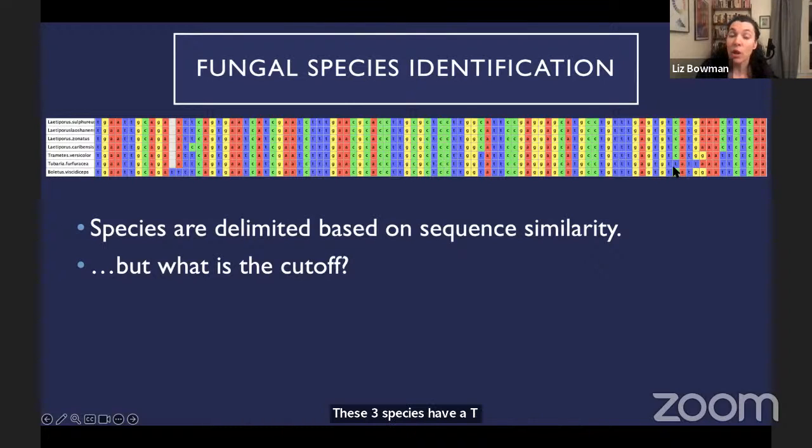So you can kind of go along and compare these sequences that you get back and look at how many differences there are. The more differences there are in the bases, and if there's insertions or maybe a nucleotide is completely missing, so there's a deletion, you can kind of figure out how distantly related it is. So this is sequence similarity.